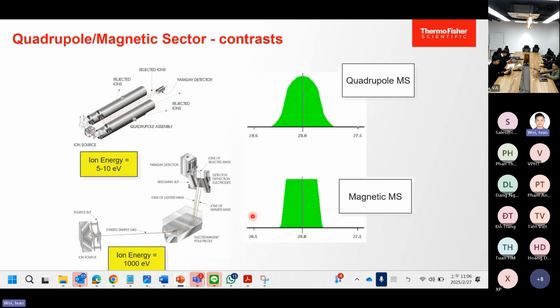As you can see here, some of you are coming from lab backgrounds, or maybe scientist backgrounds. In the market, there are several different types of mass spectrometers. Usually, what we encounter in the lab is called the quadrupole mass spectrometer. A quadrupole mass spectrometer usually comes with GC-MS, combined together to become a solution.